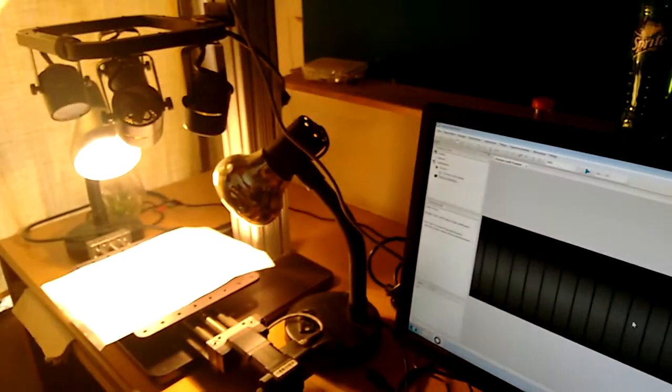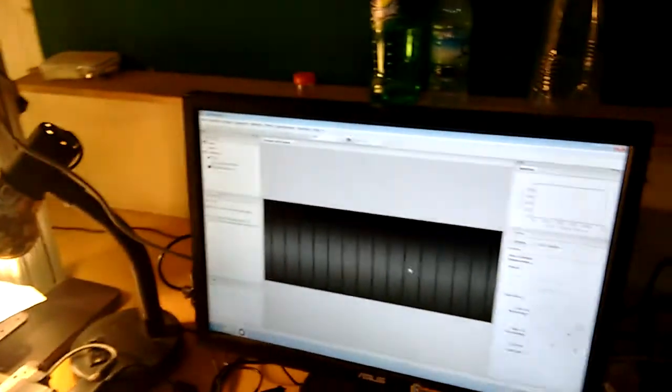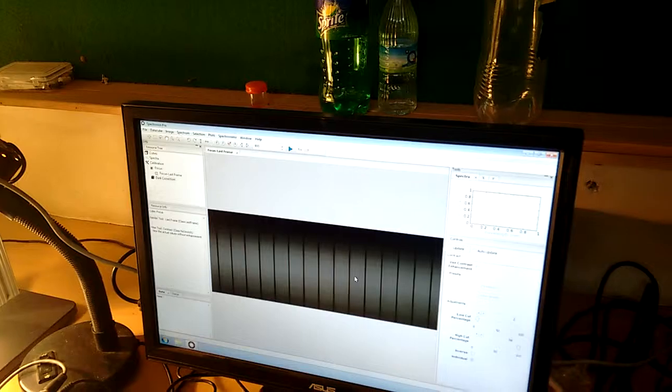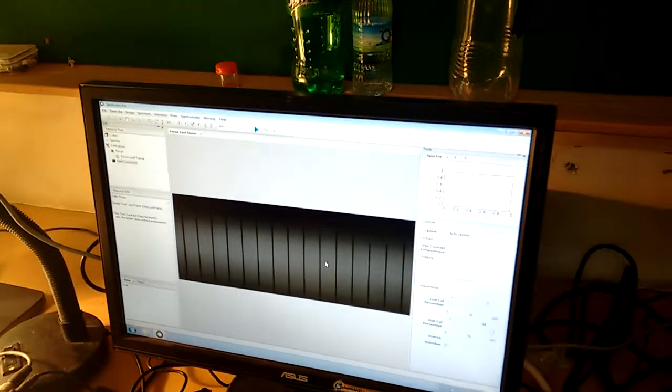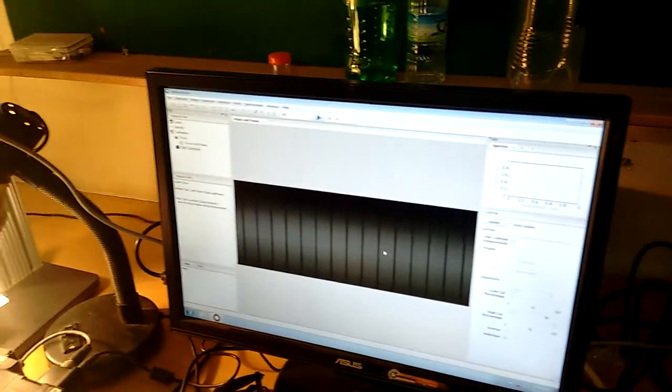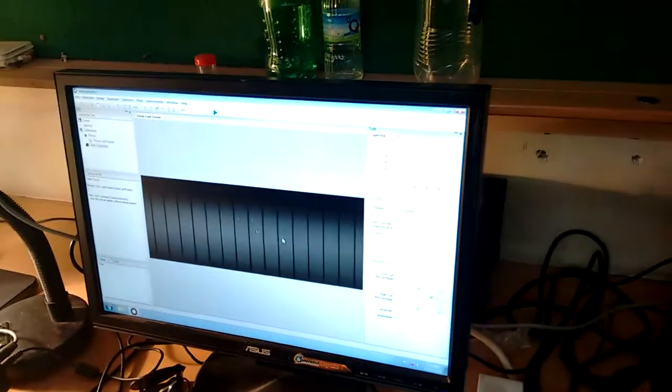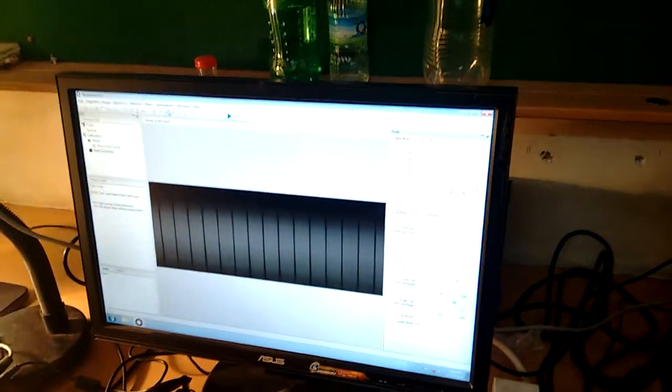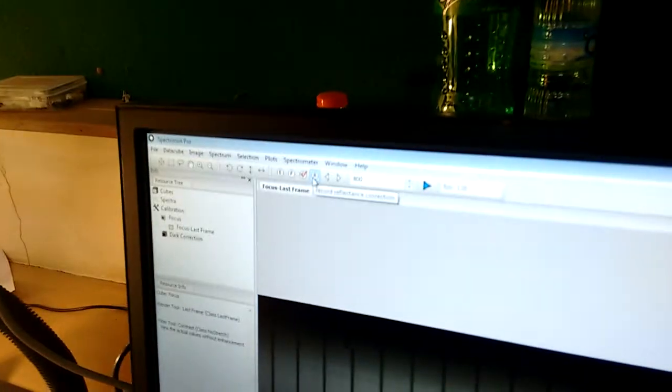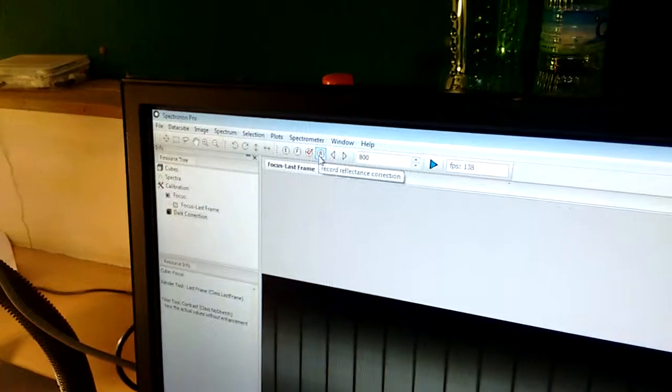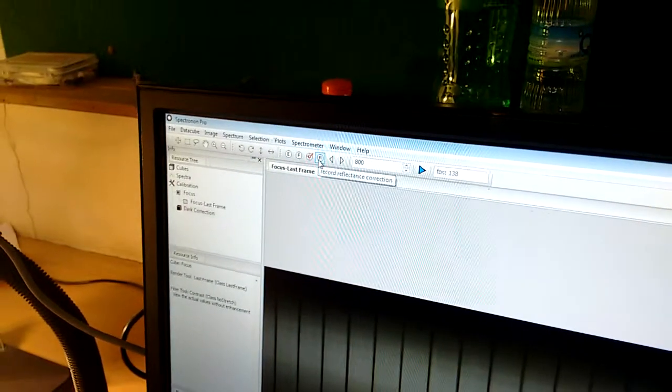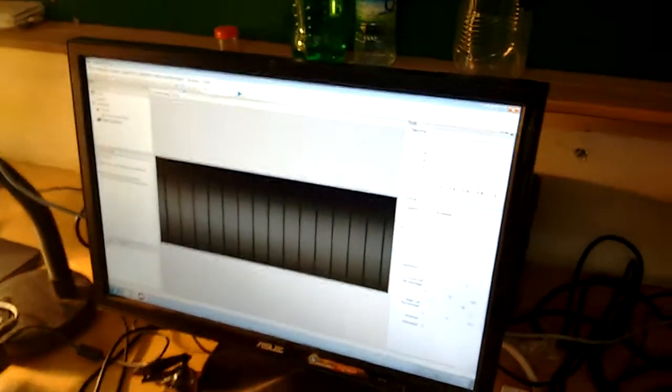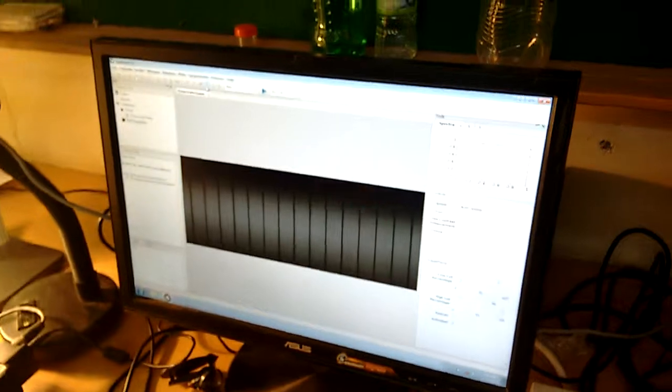Yeah, so the dark measurement is done. I open the camera lens again. Now the next step is to give the reflectance correction. I mean like what is the maximum light that can enter into the camera. So again I have to place the white reference panel.